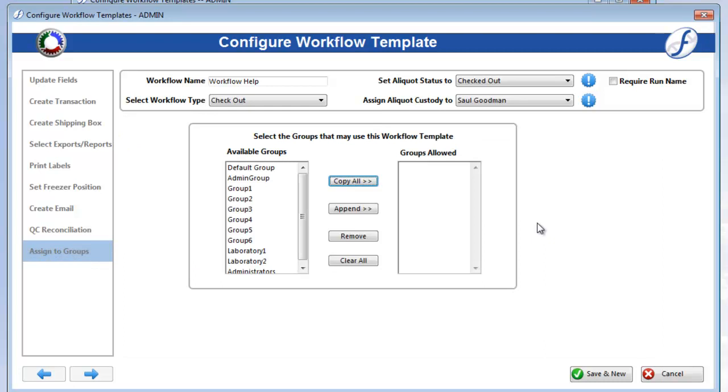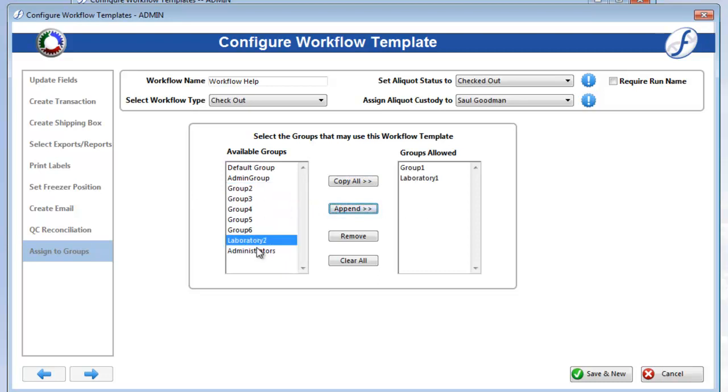Finally, to give users access to this workflow template for processing, you will need to assign it to their groups on the Assigned Groups page. Highlight and click Append, or double-click the groups that you want to allow.